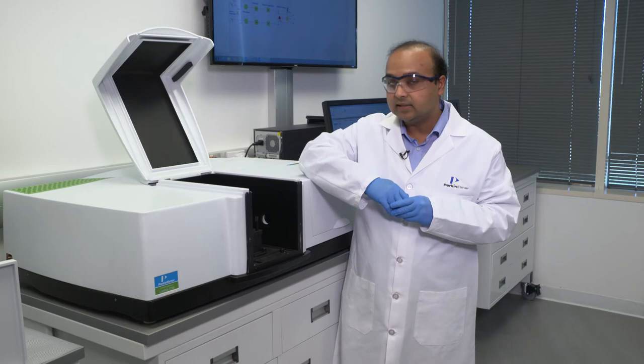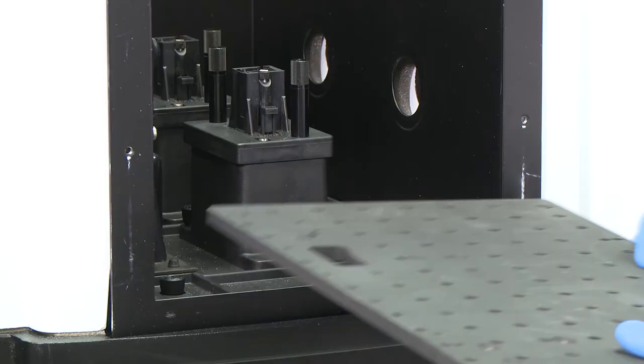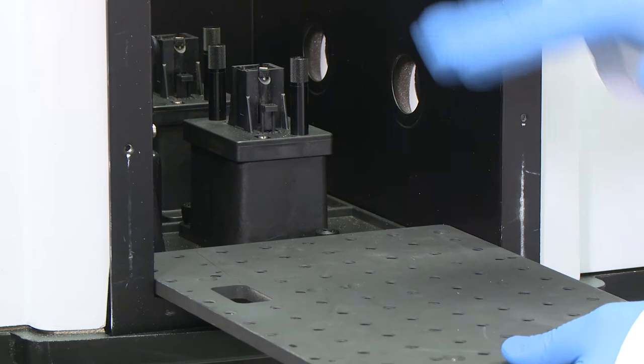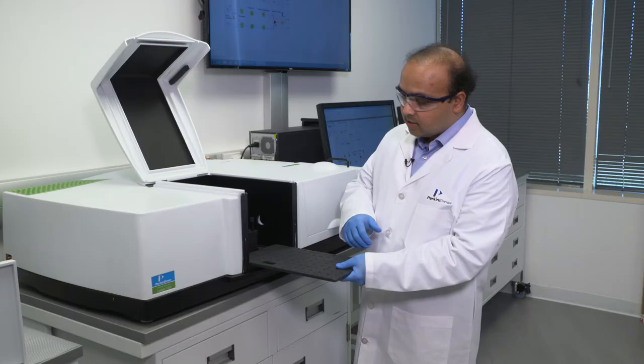What the polarizer will do is it's capable of rotating the polarizer crystal 180 degrees, so 0 to 180 degrees, both in positive and negative angles that allow us to study the effect of polarization or depolarization on the optical material. We have a general purpose optical bench here that can be inserted in the sample compartment. It slides in here, it fits perfectly well. So this is used in cases where you may want to have your own custom optical setup lined up along the sample and the reference beams.